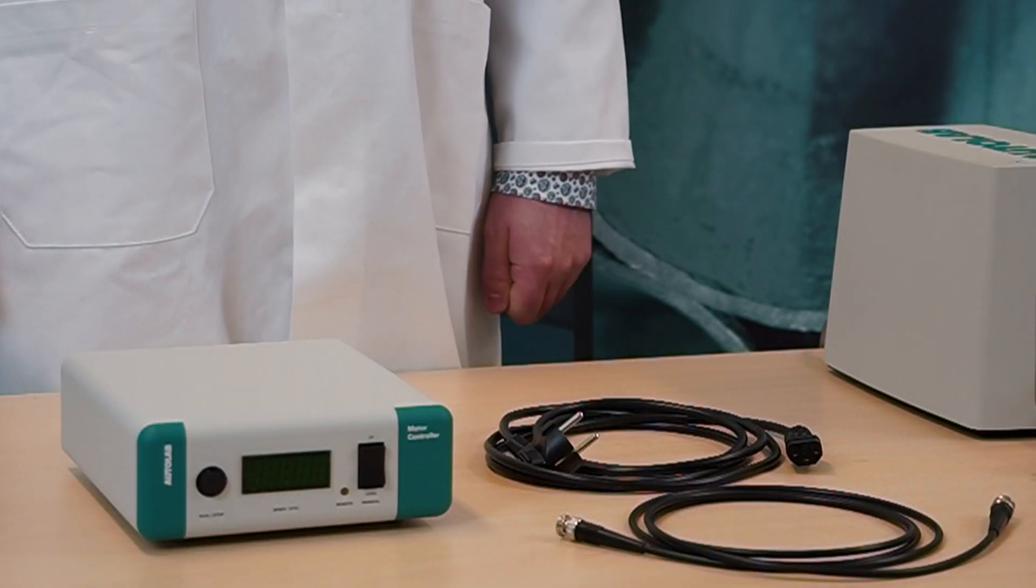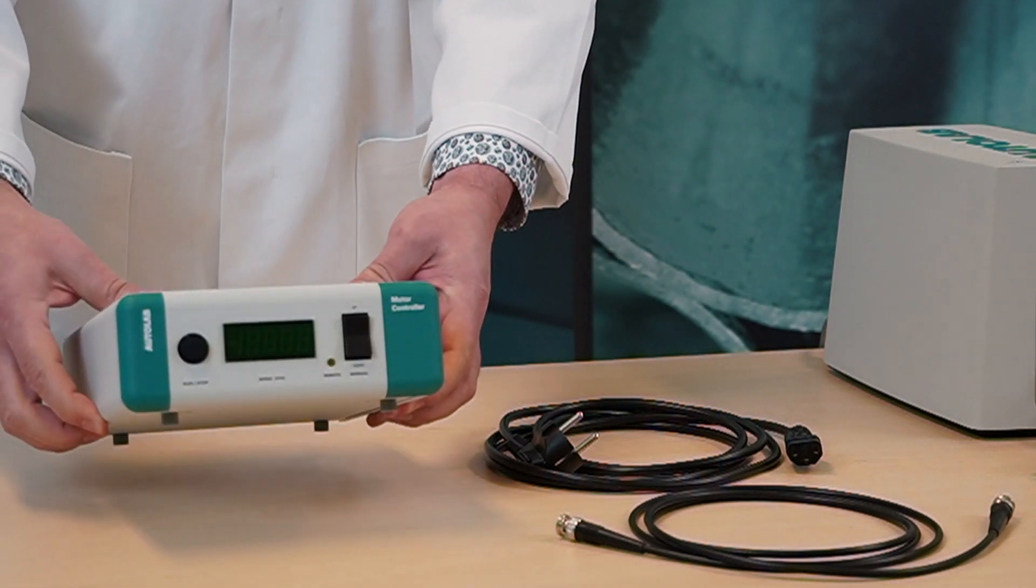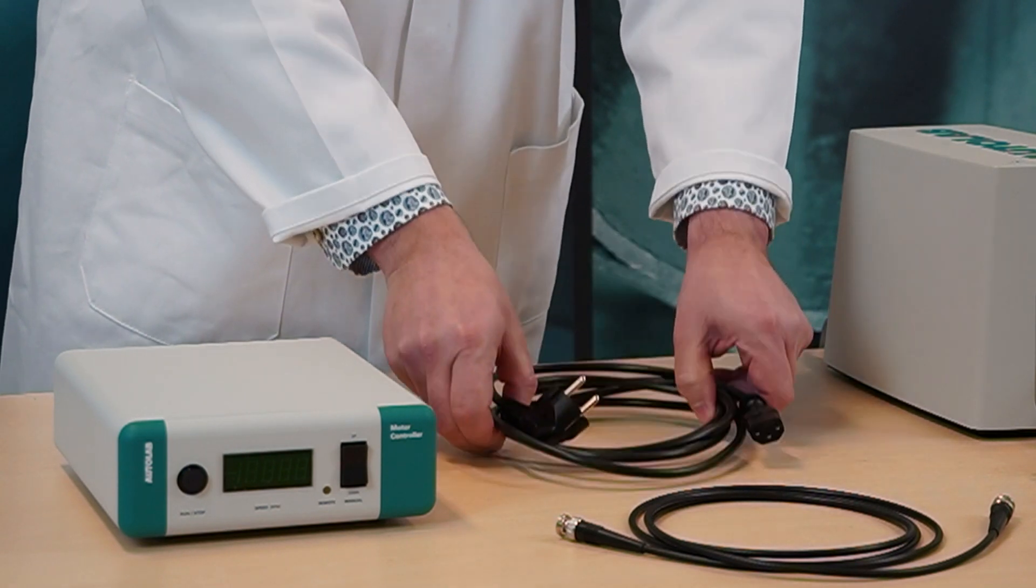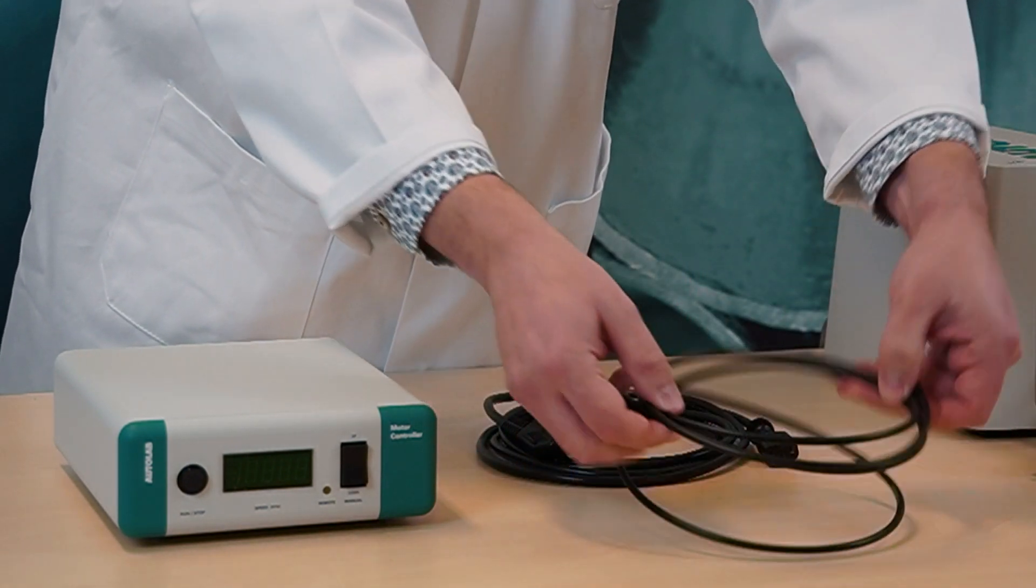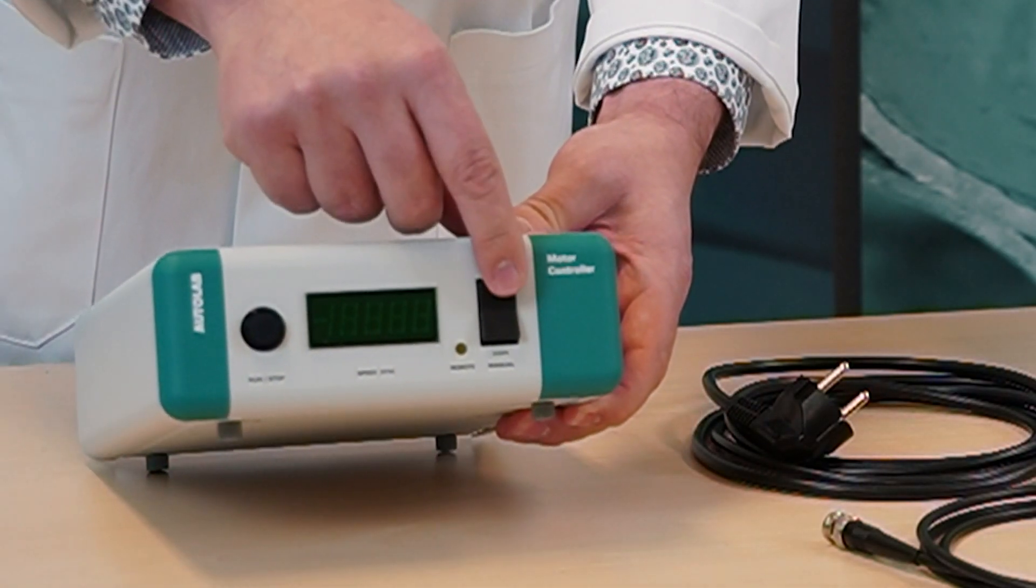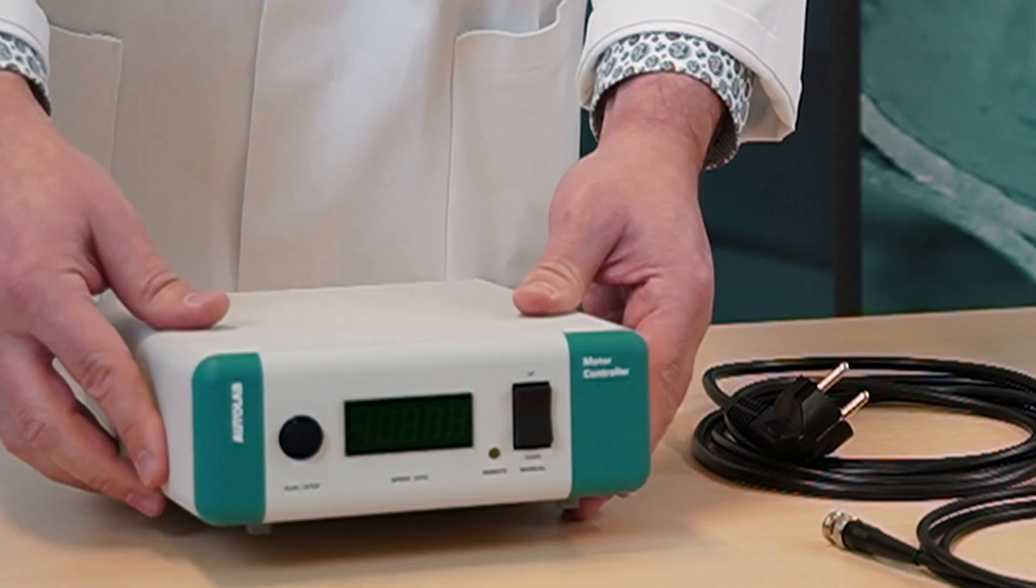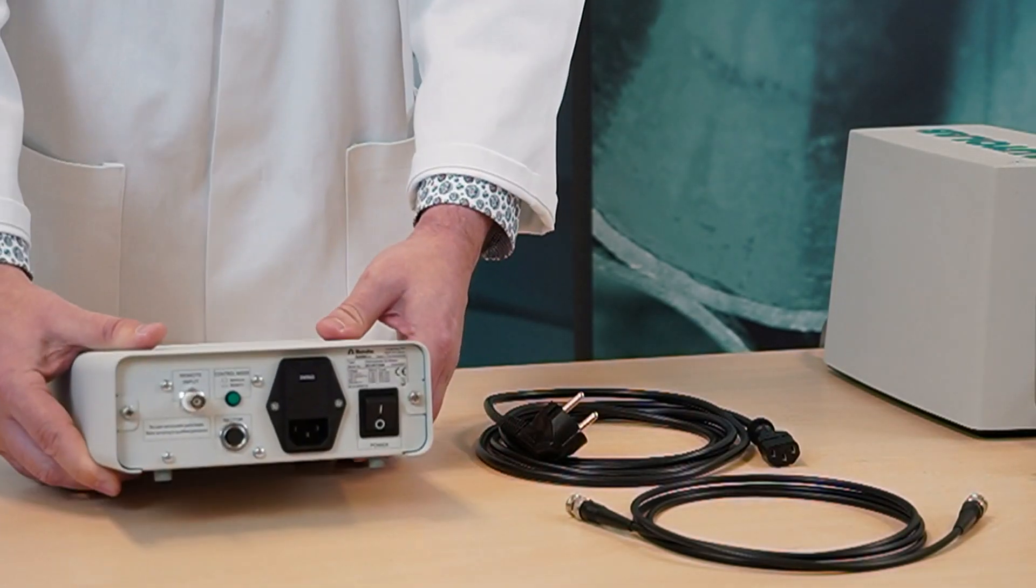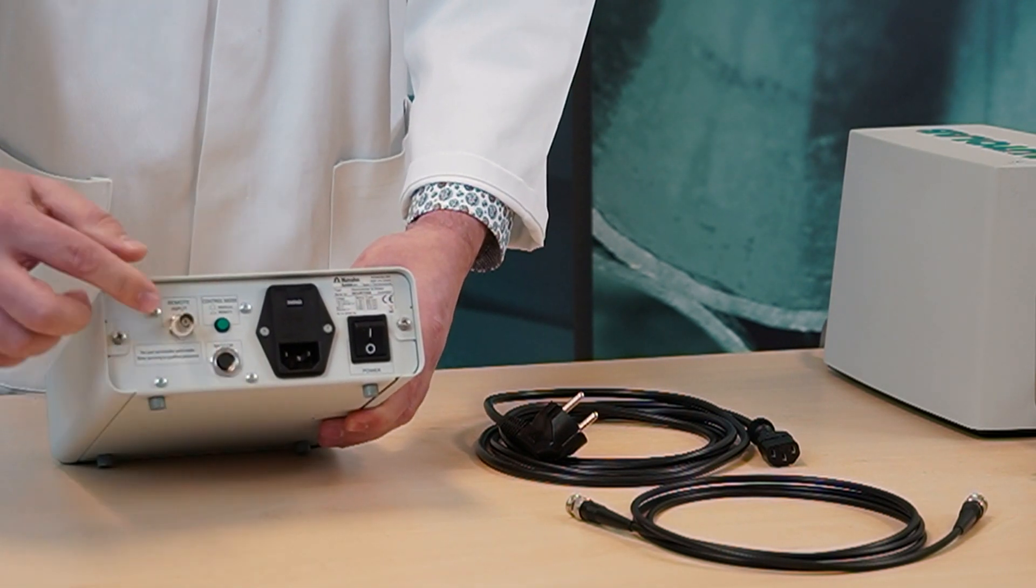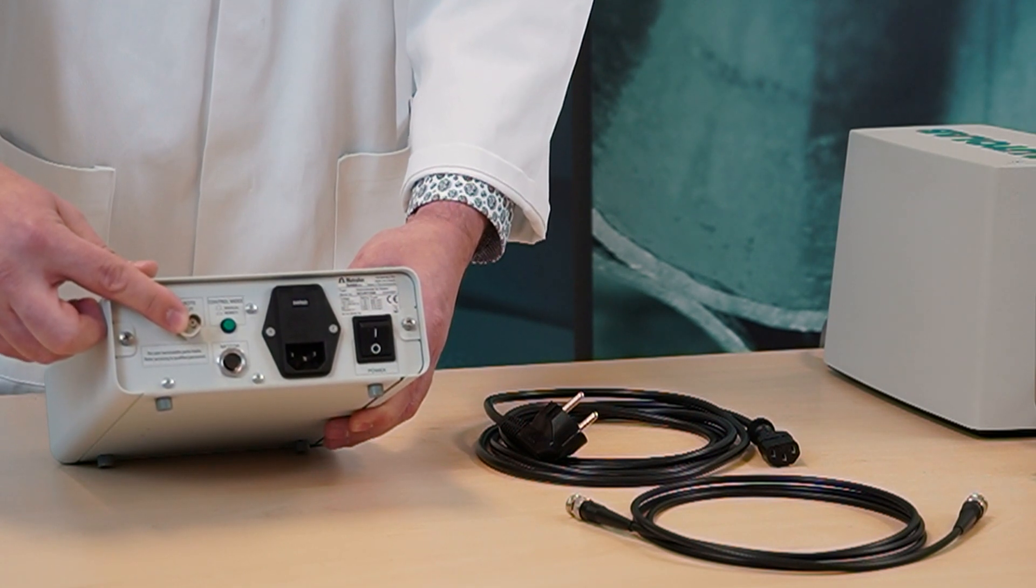In the second box you will find the motor controller unit and the power cable and the BNC cable to remotely control the rotator. On the front of the motor controller there is a manual control button for adjusting the rotation speed. On the back of the motor controller there are inputs for the rotator and also for the BNC cable to control remotely the rotation speed.